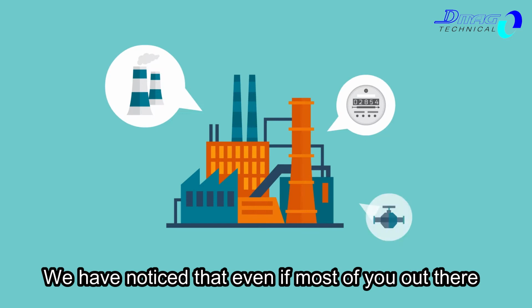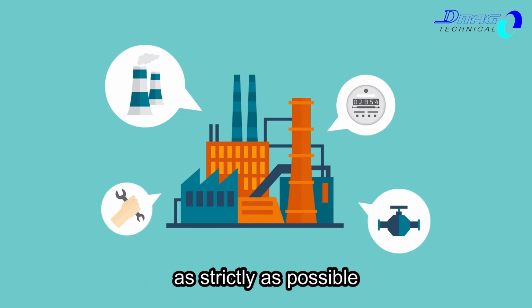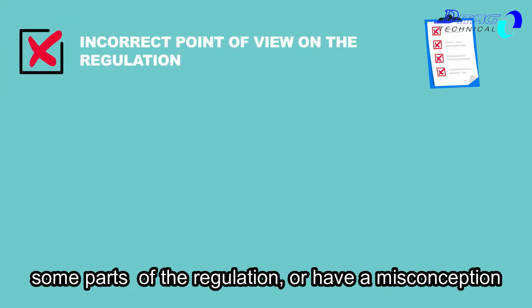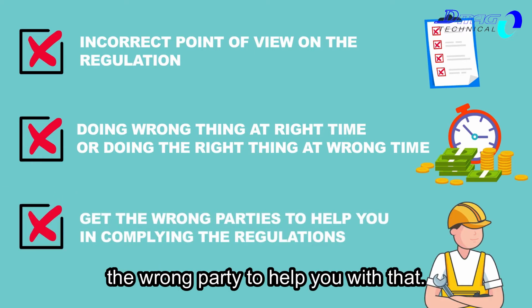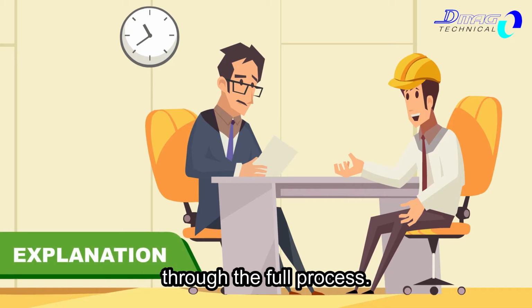We've noticed that even if most of you out there have tried reading and following the regulation as strictly as possible, many people have either misinterpreted some parts of the regulation or have a misconception of what to do at which point of time. Or you may have hired the wrong parties to help you with that. So here we would like to walk you through the full process.